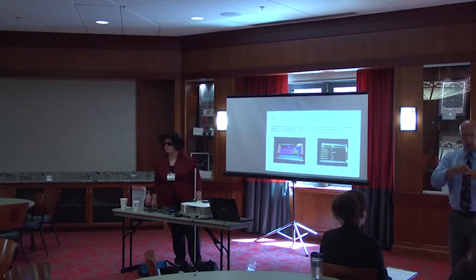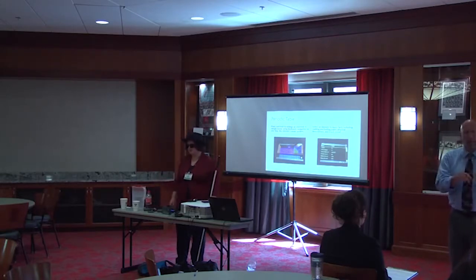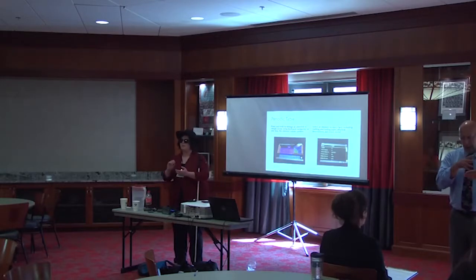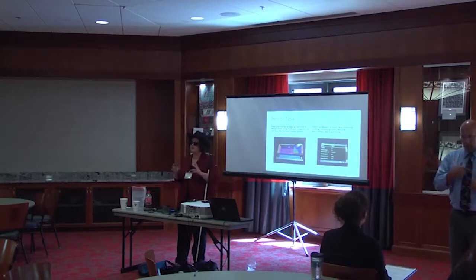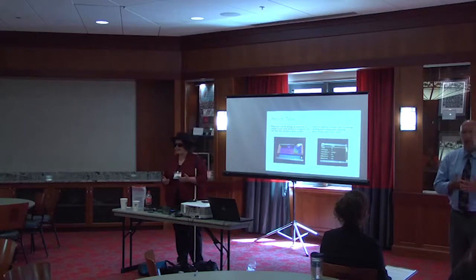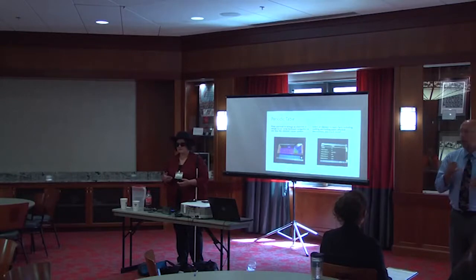Let's see, people over here. Marco. All right, so here's that for you. And so everyone can pull out their LabQuest and work together as a group. There's a keyboard interface on the top left corner if you have the keyboard.